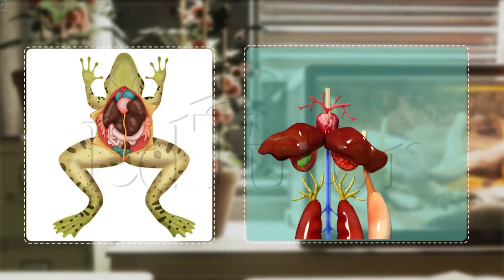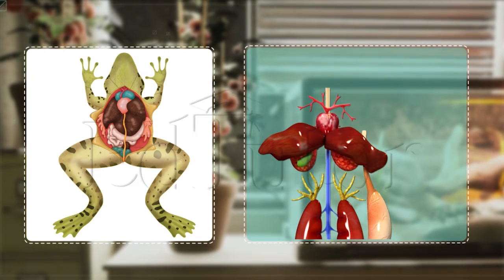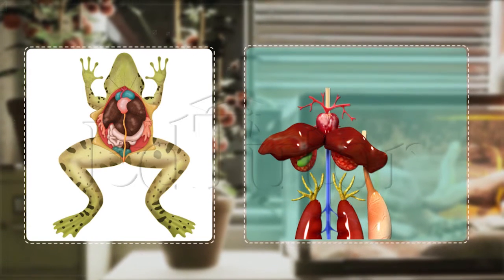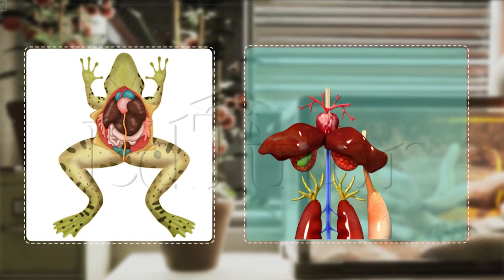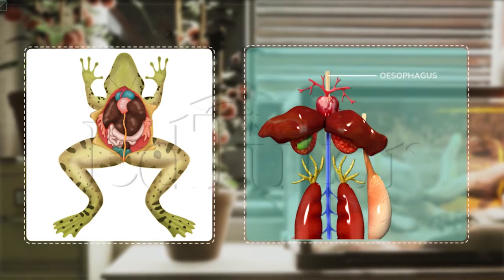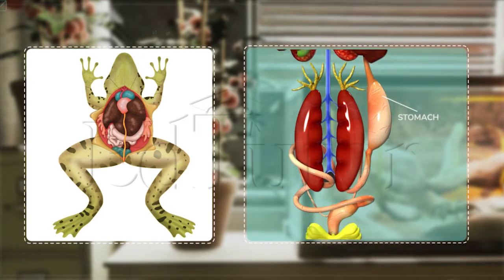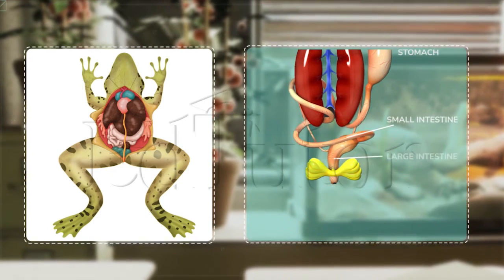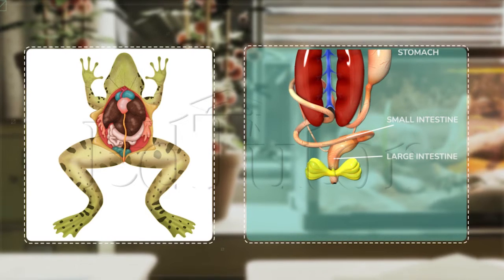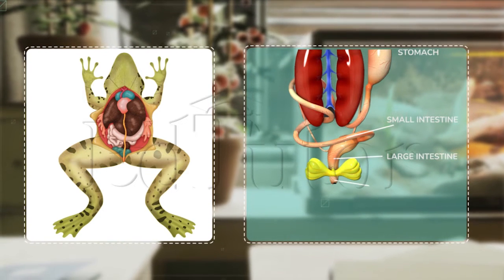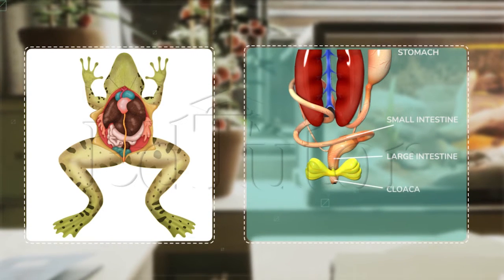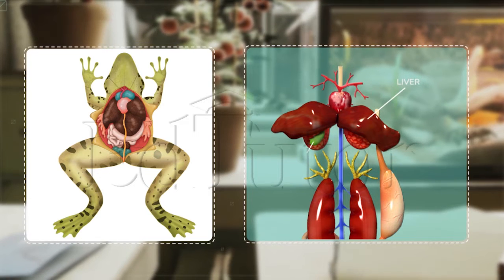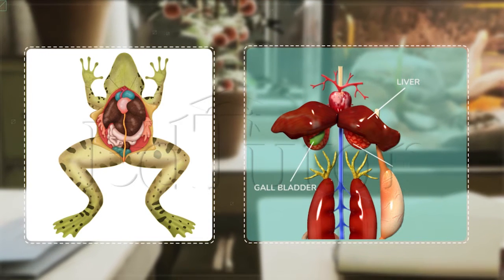The organs of the digestive system, as you can see here, start right through the mouth. This is the esophagus, the stomach, and these are the intestines — the small and large one — and the cloaca. There is also the liver, gallbladder, and pancreas here.